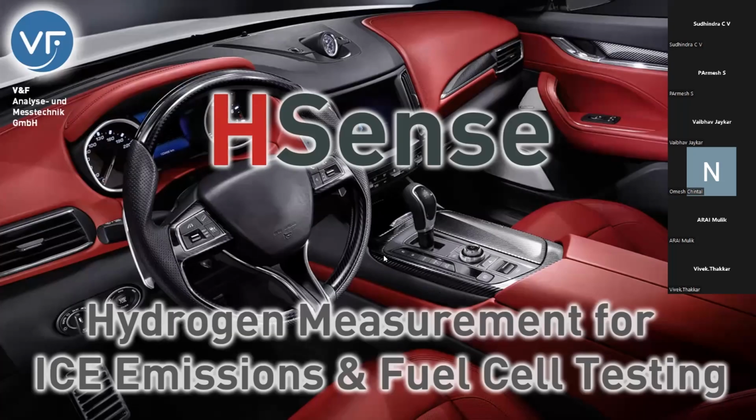In the second part of this session, we're going to have a live demonstration on one of the instruments so that you can get a look and also a feel of how this instrument is accessed, on the most basic level, via our control software. We have a small measurement chamber where we can produce different concentrations of hydrogen and measure them with the instrument directly. Okay, so again, welcome.